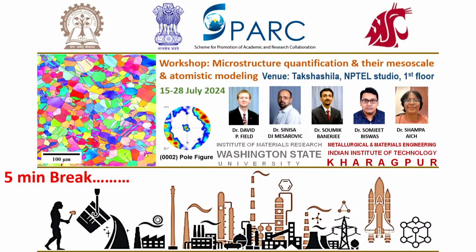Right, so we'll do crystal orientation, and let's add a specific orientation, maybe 1, 1, and let's do, it's telling me I can't do that one, so something like this, right? -110.